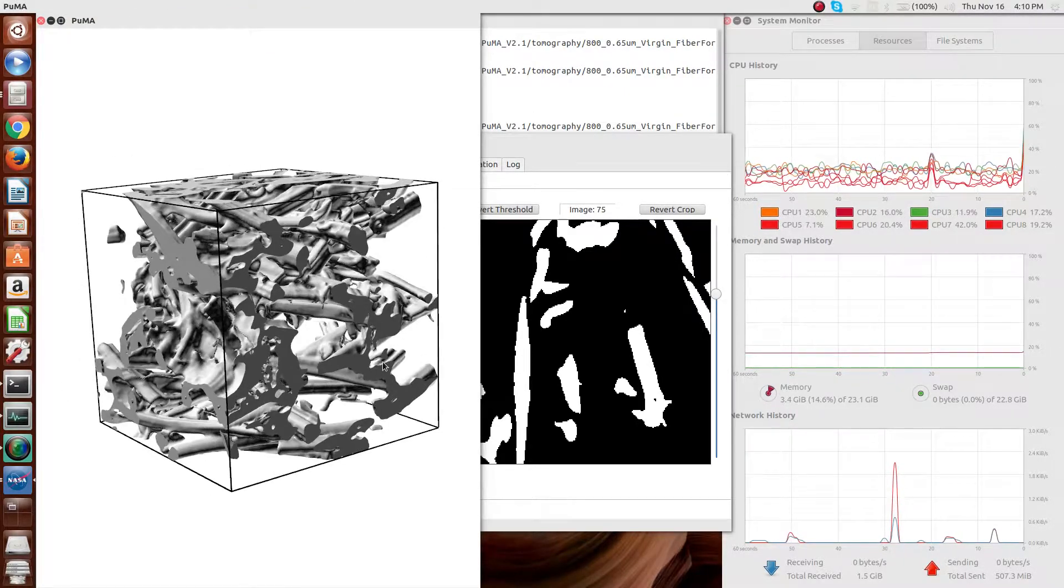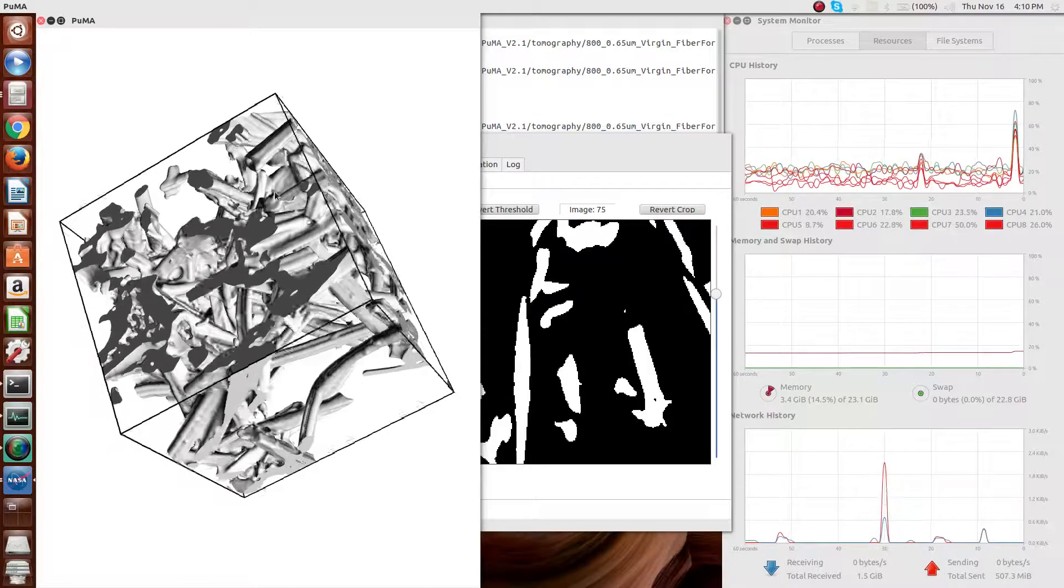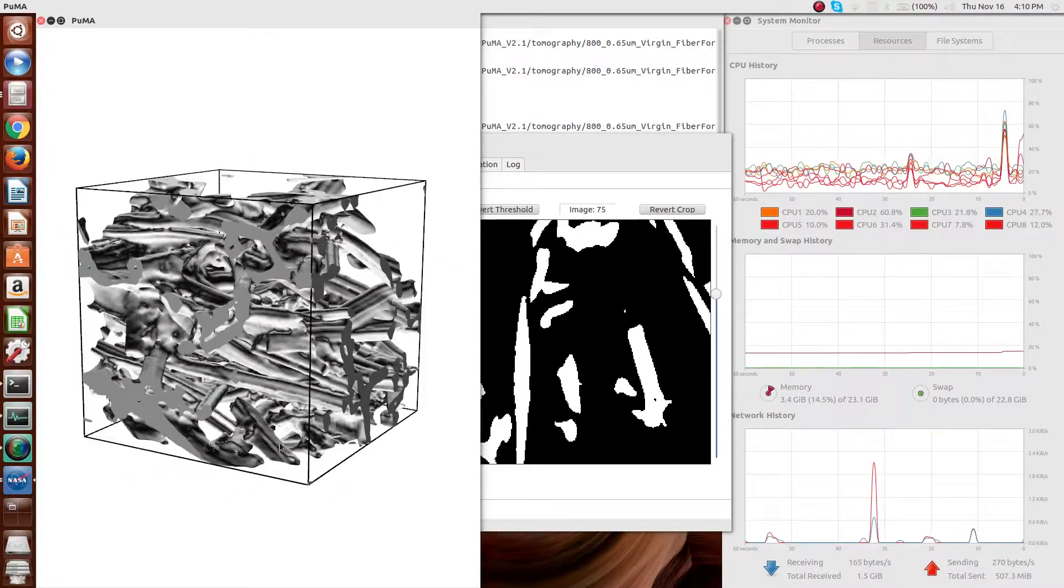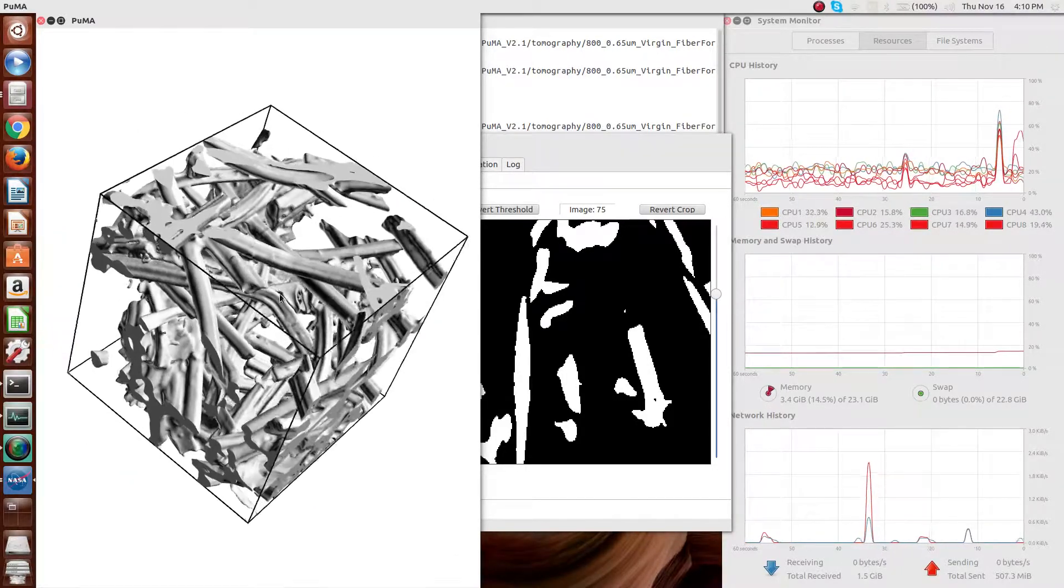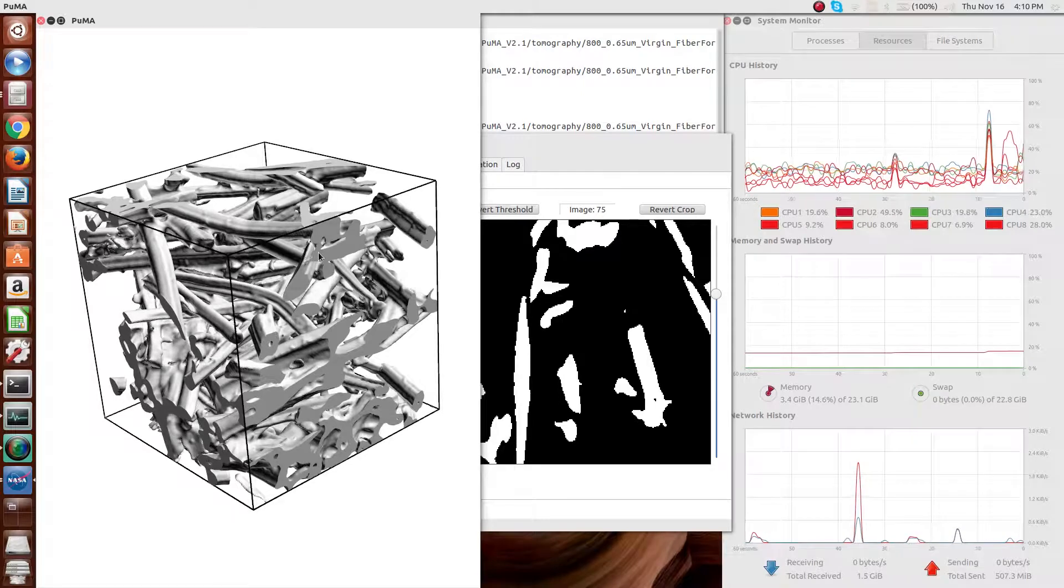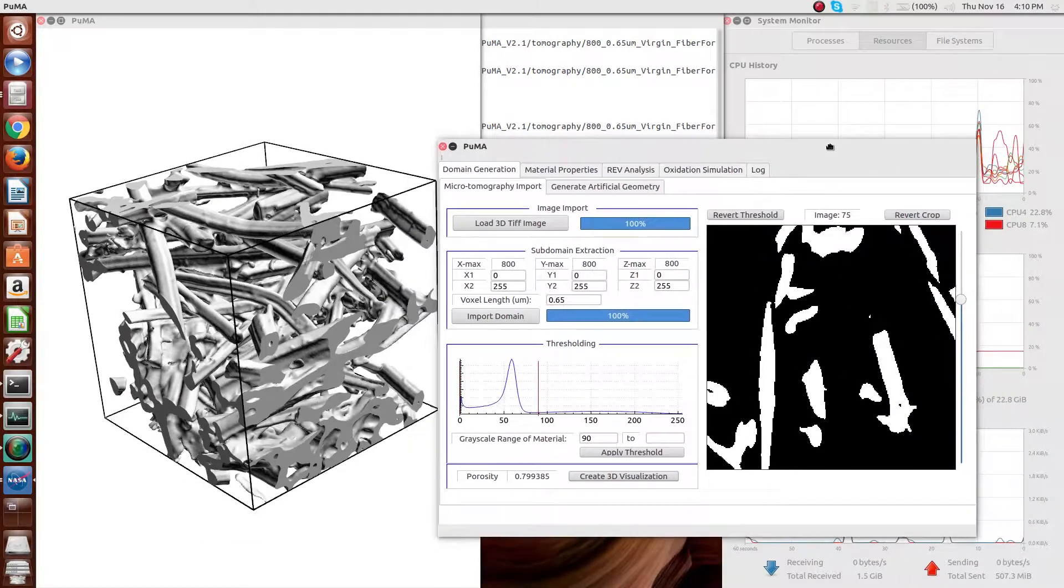As I mentioned earlier, this is a very small sample. Typically, analysis would be done on much larger samples, but for the point of brevity, I'll do it on this small sample.